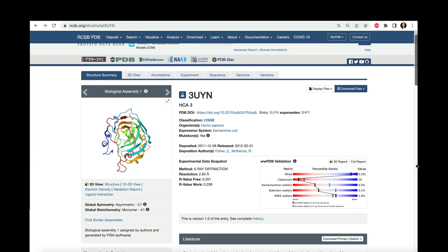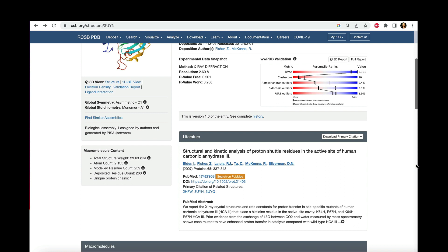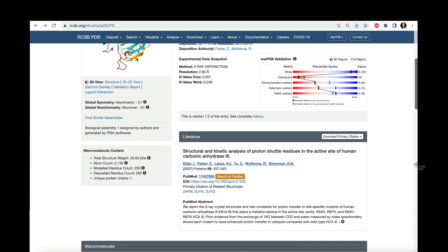From the RCSB page, we can access the manuscript describing this structure. Some manuscripts are behind a paywall, but this is where I found one that gave numbers for the important amino acids in this lesson's structure.